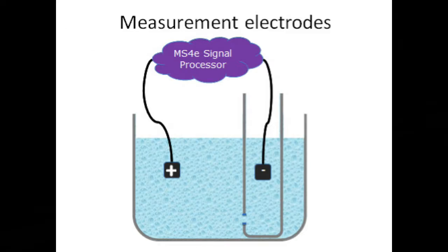And the size range itself is determined by the sensor in the system, which we refer to as aperture tubes, and the way the technology makes a measurement is, again, elegant in its simplicity. We've got an aperture tube which has an internal electrode, and it's placed into a conductive medium, something that has some level of ionic strength so it can carry a current. And there is an external electrode in that medium.